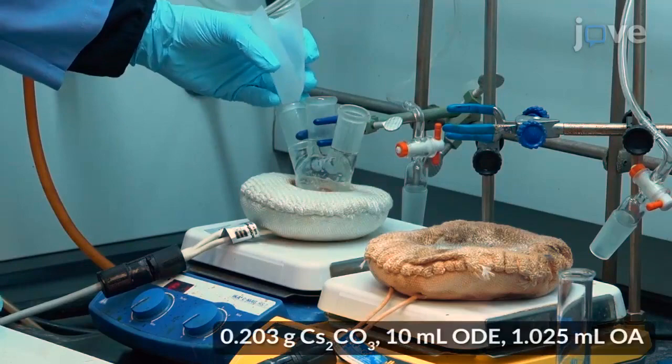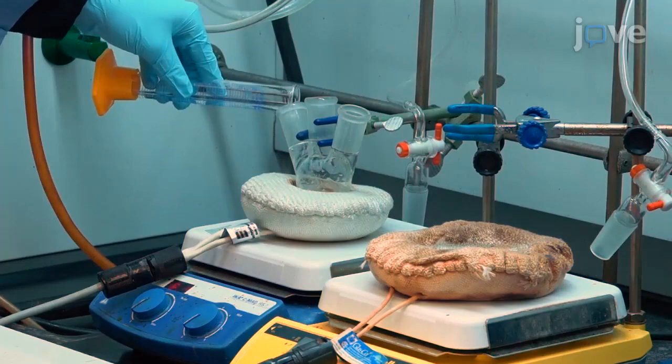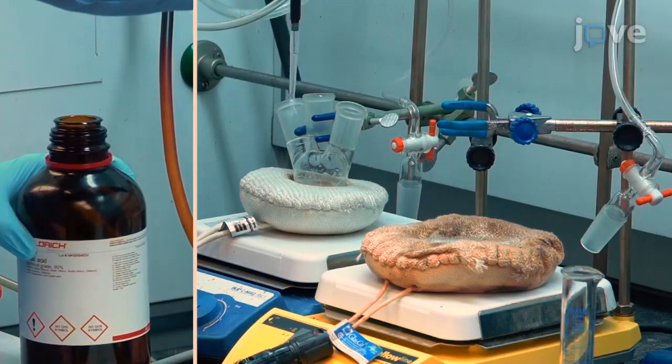To prepare the cesium oleate precursor, add 0.203 grams of cesium carbonate, 10 milliliters of octodescene, and 1.025 milliliters of oleic acid to a three-neck, round-bottom flask containing a 2.54 cm magnetic stir bar.